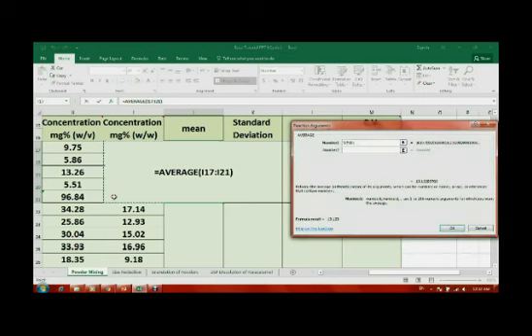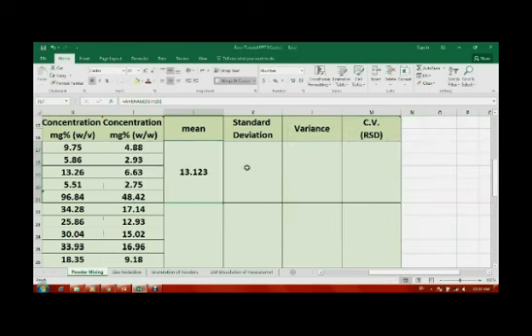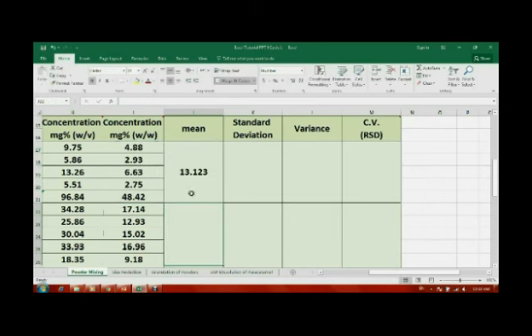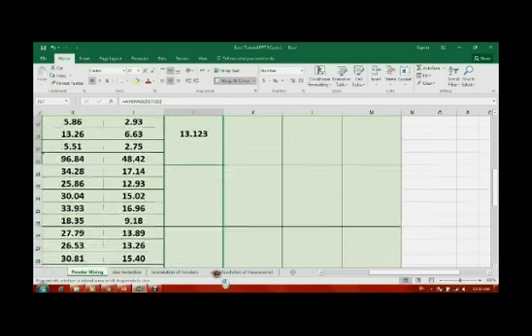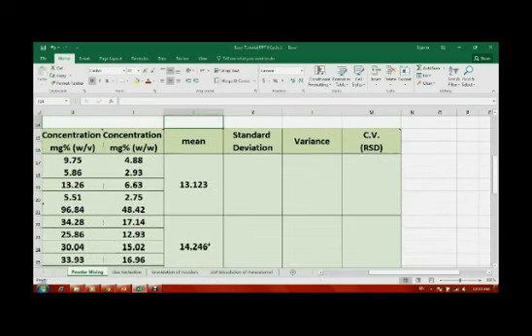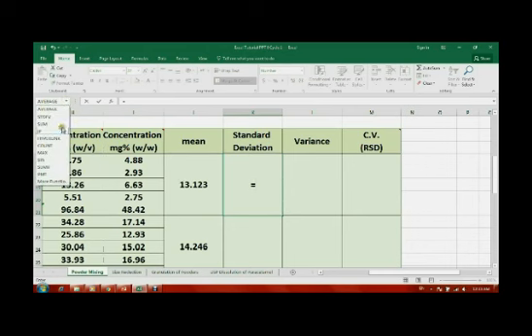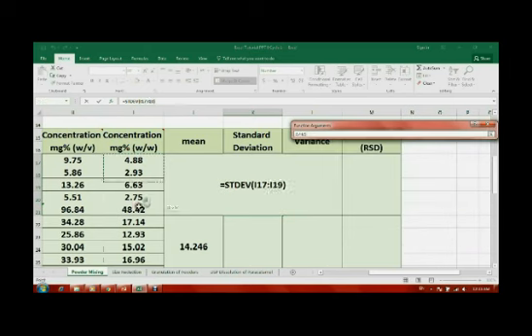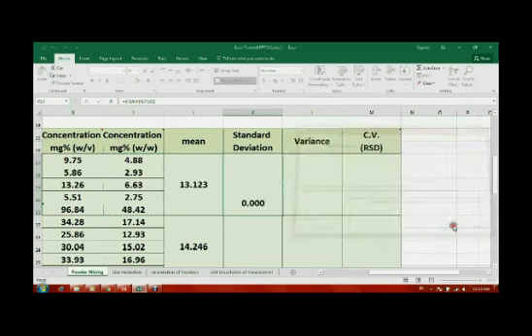This would be the concentration in milligram percent weight per volume. Generally speaking, to calculate the concentration milligram percent weight per weight, regardless of the sample size and the final volume of the prepared sample, you have to divide the concentration in milligram percent weight per volume by the amount of sample in the final volume of the concentration times 100%.